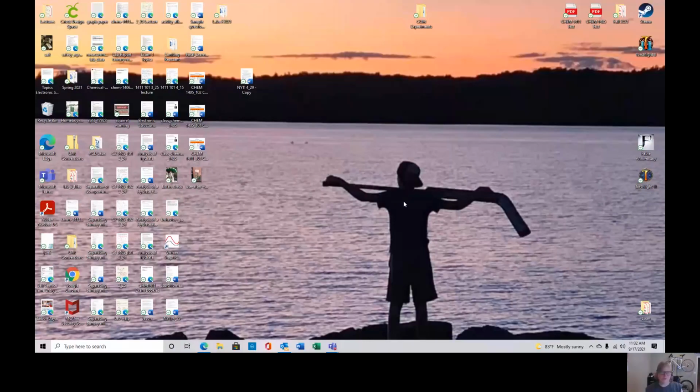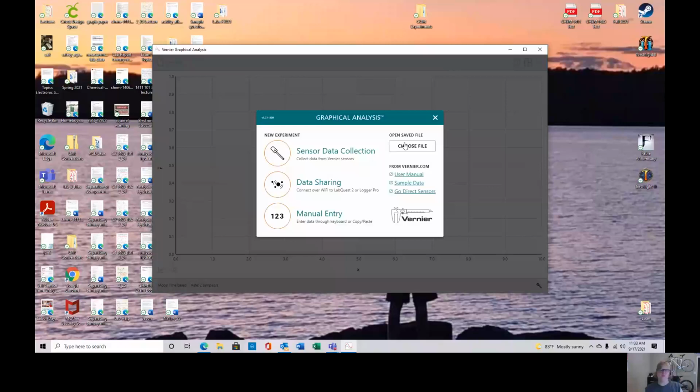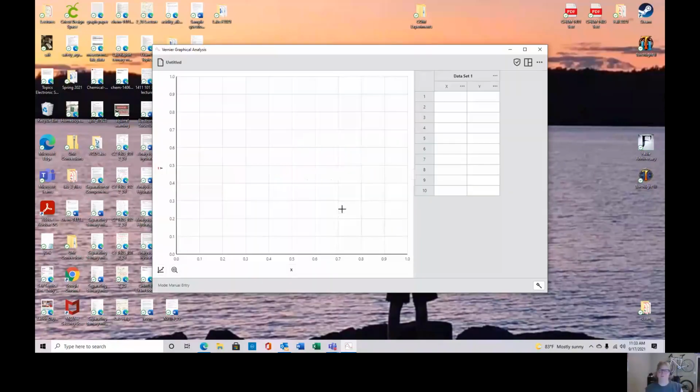This is just a short video tutorial on how to create a graph using Vernier Graphical Analysis. This video will assume that you have already downloaded and installed the program. Once installed, your desktop icon will look like two curves. And when you open it, you have three options. We will be using manual entry.